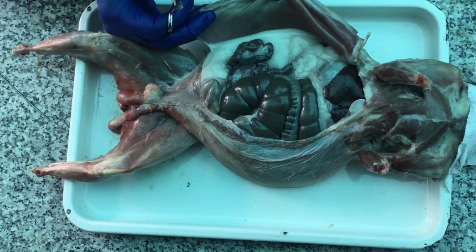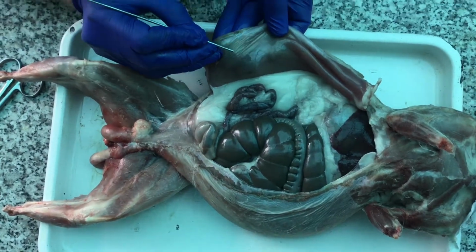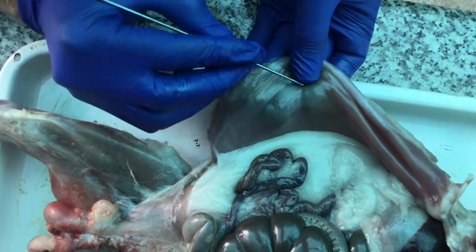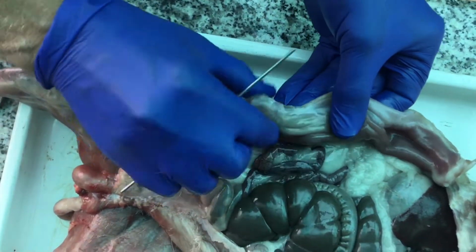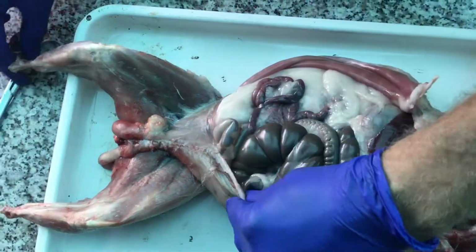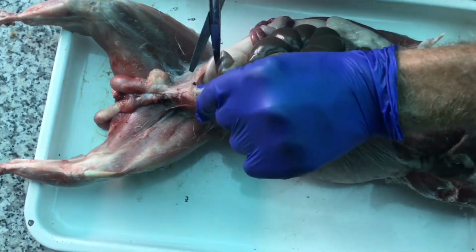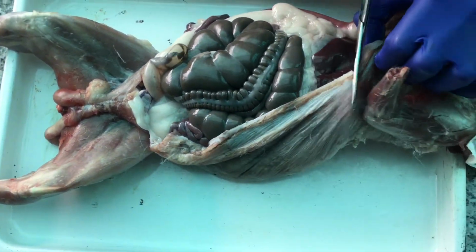And on its interior surface, you can start to see that nice sheeny, saran wrap serous lining. What down here would be the peritoneum, in this case, the parietal peritoneum, because it's part of the parietal or somatic or outer tube of the body. And the same thing if I open up on the other side, making those nice big flaps so we can really see everything that's in the abdominal cavity.